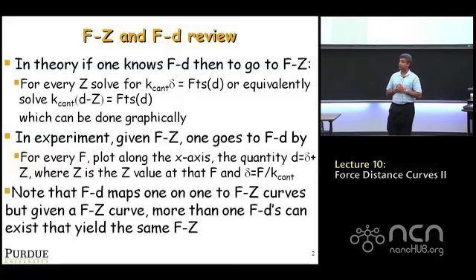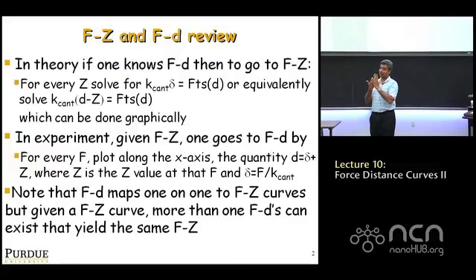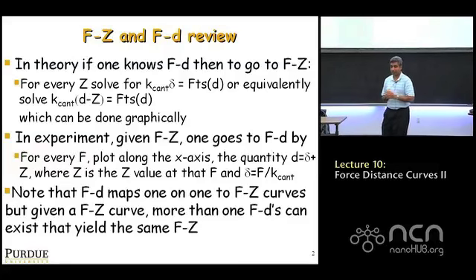So F versus d is this fundamental quantity, a curve that represents the net force between these 10 to 100 atoms in the tip and 10 to 100 atoms in the sample. F versus d is a fundamental property of the surface, of the interaction between the tip and the sample, when you measure the aggregate force versus separation.